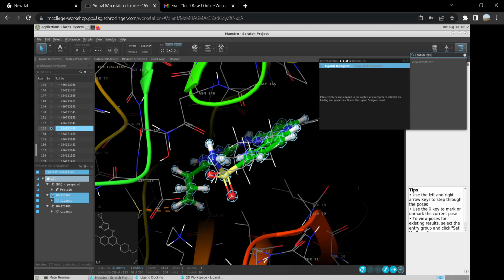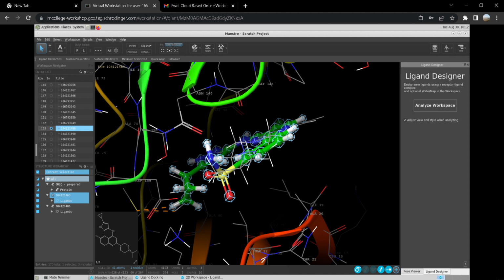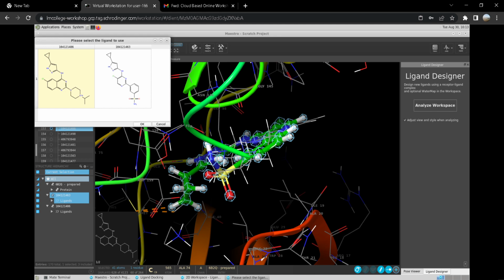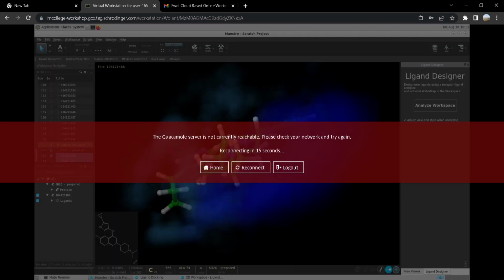If you add something like this one, now you can see that this particular thing became a hexagon. And now if I click on one more, it's a heptagon. If I click on one more, it's going to be an octagon. And that is the highest dimension you can go to. You can't go to 9 dimensions, things like that. So I'm going to remove those extra things that I added. So I'll just make sure I uncheck them and make it back to a pentagon, which is easier for us to interpret and understand, because the properties are very well known in terms of what the molecular weight should be and what these numbers should be for your molecule.